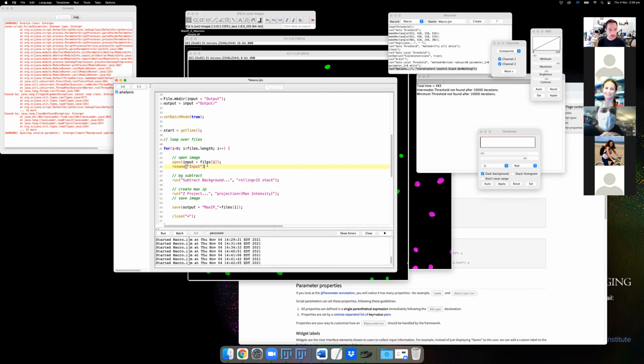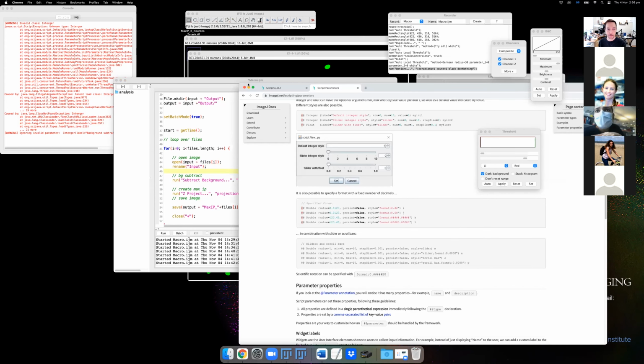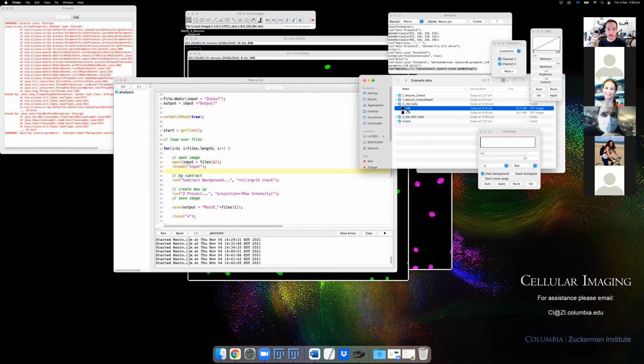That way, because the image is going to come in as the file name and it can be different for every single image, and that can be a bit of a pain to deal with. So just having a very short name to call it when it comes in makes that whole pipeline much easier to deal with. And we have this image, just going back to the raw data. So these are our raw images.